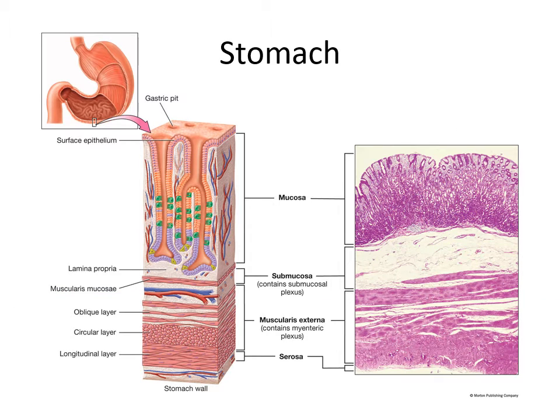Moving into the stomach, which is a little bit different because it has three muscle layers — an outer longitudinal, deep to that a circular, and then an innermost oblique — which is different and allows it to churn the food. The stomach is also different in terms of the structure of its mucosa. So instead of stratified squamous epithelium, now we're going to have simple columnar epithelium. You can appreciate these single continuous layers of columnar cells, and they dive down and form these pits — these gastric pits are where gastric juices are going to be produced.